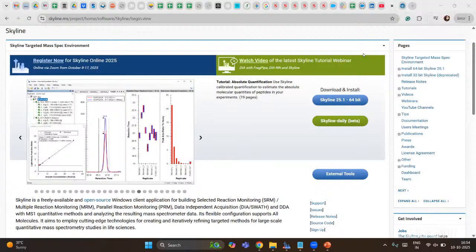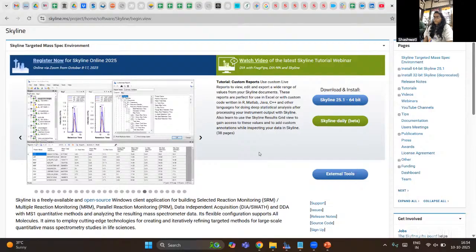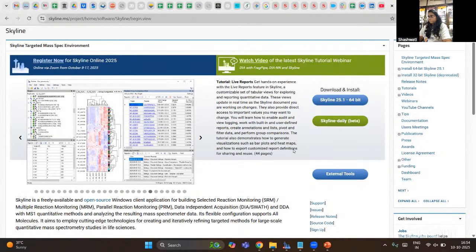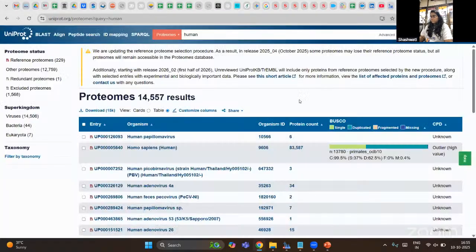Thank you, sir. So good afternoon, everyone. So I'll show one software which you can use. It's a freely available software that you can download from the internet. So this is the Skyline software. You can download the Skyline daily beta version to utilize this. And another thing you will need for using Skyline would be the background proteome.